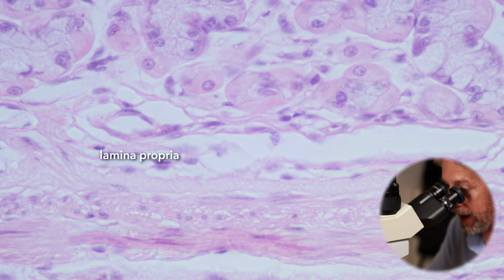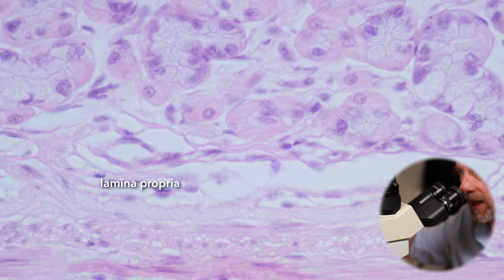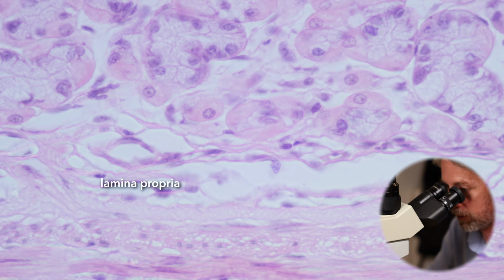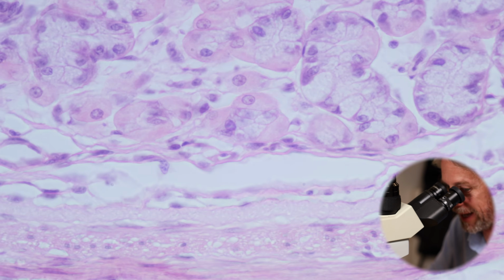And if we go down there, we can see a bit of the lamina propria, but essentially the gastric glands are in the lamina propria. The lamina propria is moving in and supporting them. But we can see a bit of connective tissue there, right? Those stringy shapes and those flatter cells.